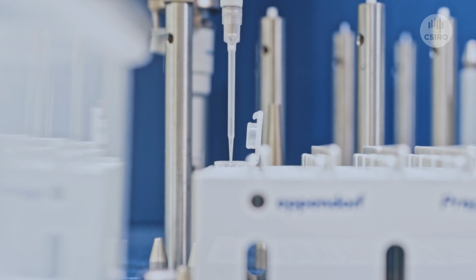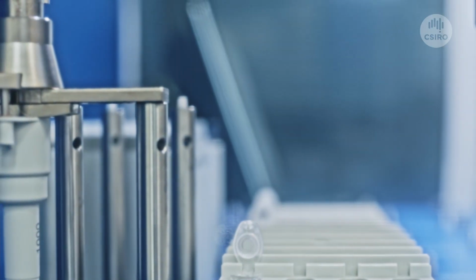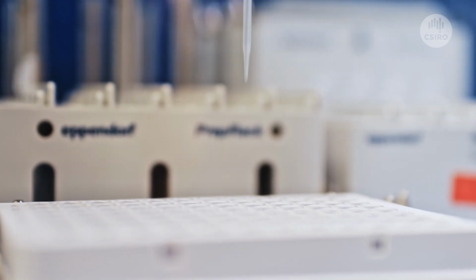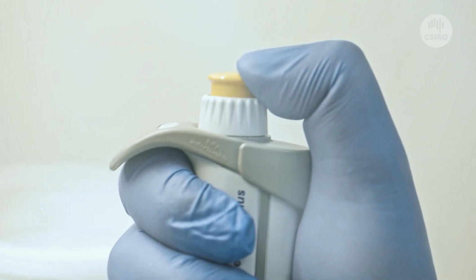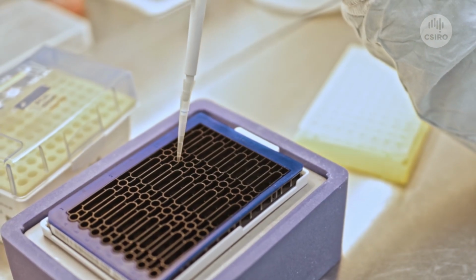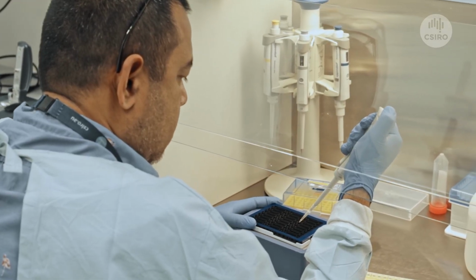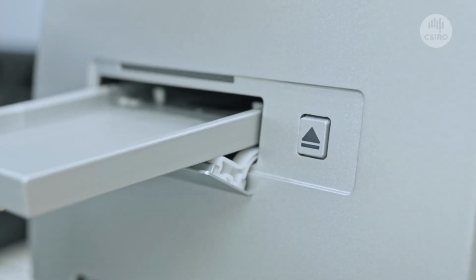We use a quantitative PCR platform which amplifies many billion copies of genetic fragments and generates amplification curves. We are also using digital PCR, which is more sensitive than conventional qPCR and performs well for trace detections. It has 28,000 nanowells and can detect a single gene fragment of SARS-CoV-2 RNA.